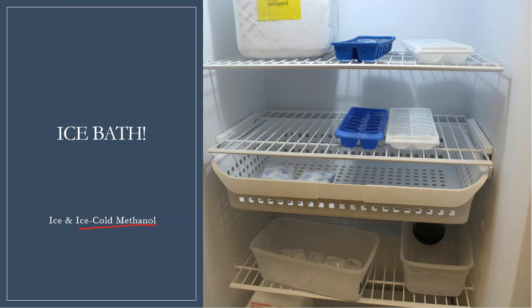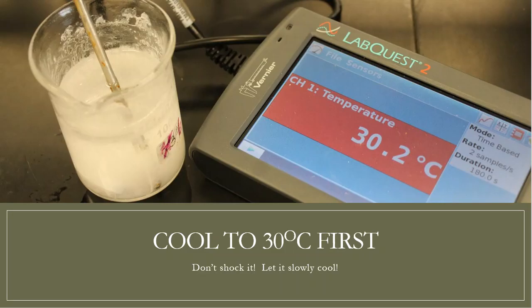And I'll show you what happens because it happened to me. It wasn't as cold as what it needed to be in the separation stages a little bit later on. All right, so finally I bring out the temperature probe. I put the temperature probe into my alkane beaker. So that's the clathrate with the alkanes and the urea and the methanol. And that solution was reading about 30.2 degrees. So this was okay. It said that once it reaches 30 to then put it into the ice bath.